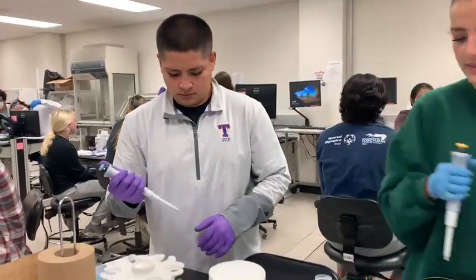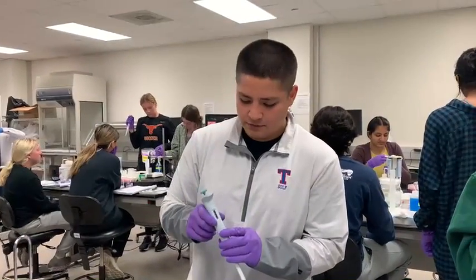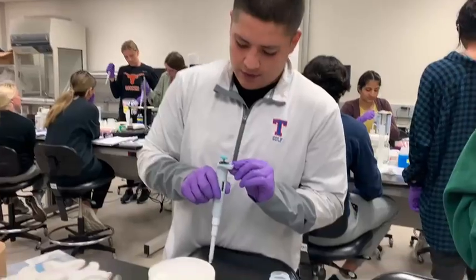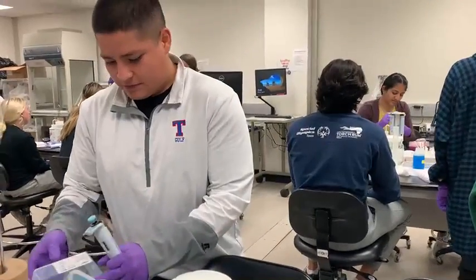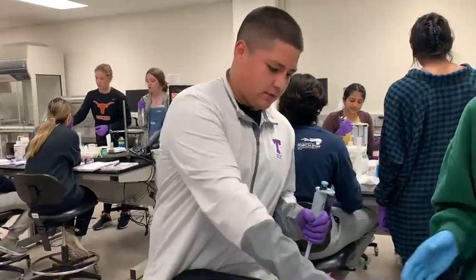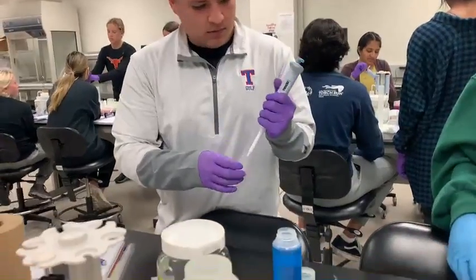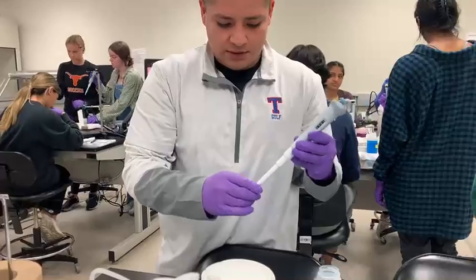All right. I'm Anthony. I'm going to do 250 microliters out of the 100 to 1,000. I'll grab a tip and close right after. It's already set on 250 and it's locked. I'm going to put the tip on.